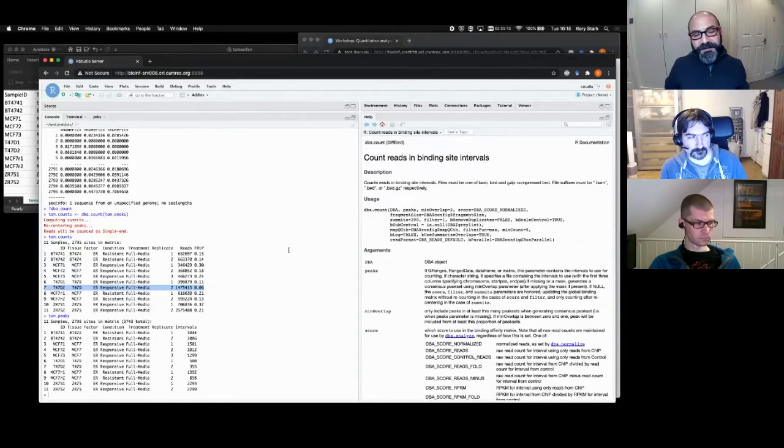There is a lot of variance, and what accounts for this is mostly the ChIP efficiency. People have in their mind that in these assays you pull down just the enriched stuff, but all you're doing is enriching. So if before the pull down the signal you were interested in counted for 0.01%, and you end up with 10%, that's a huge amount of enrichment.